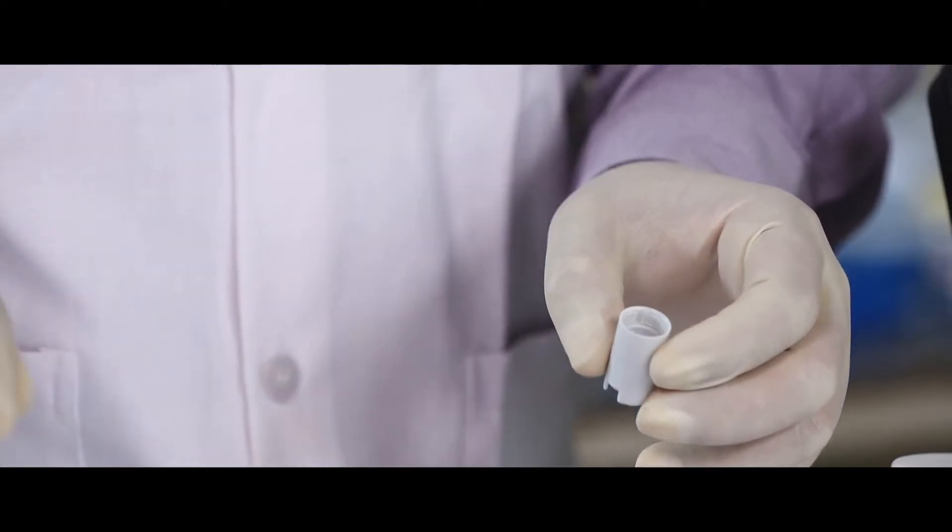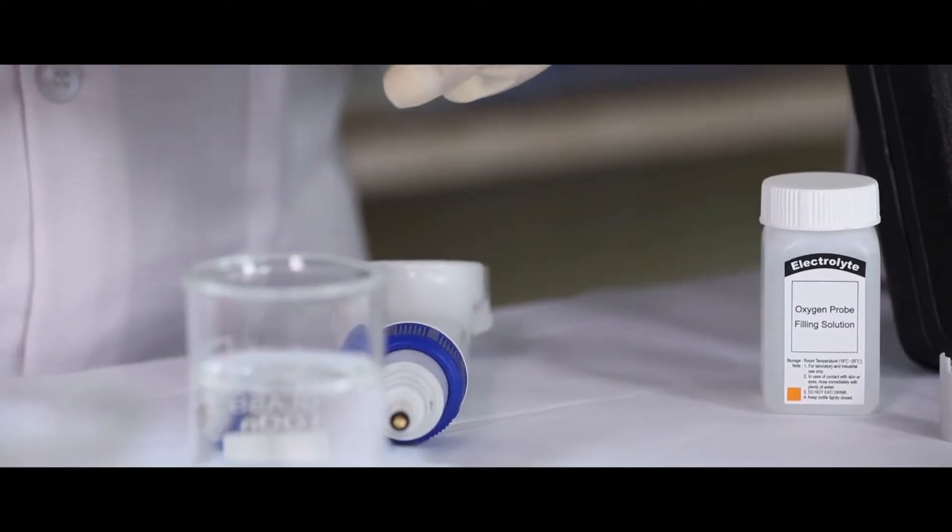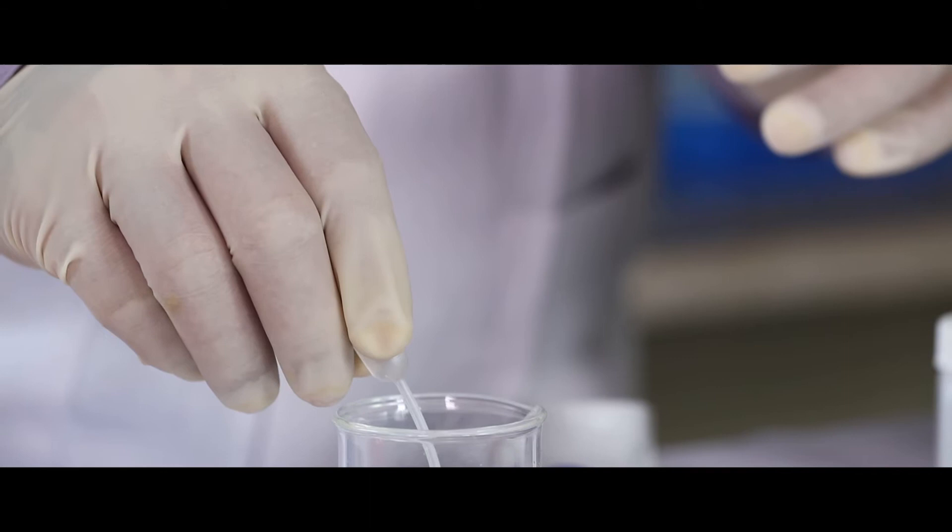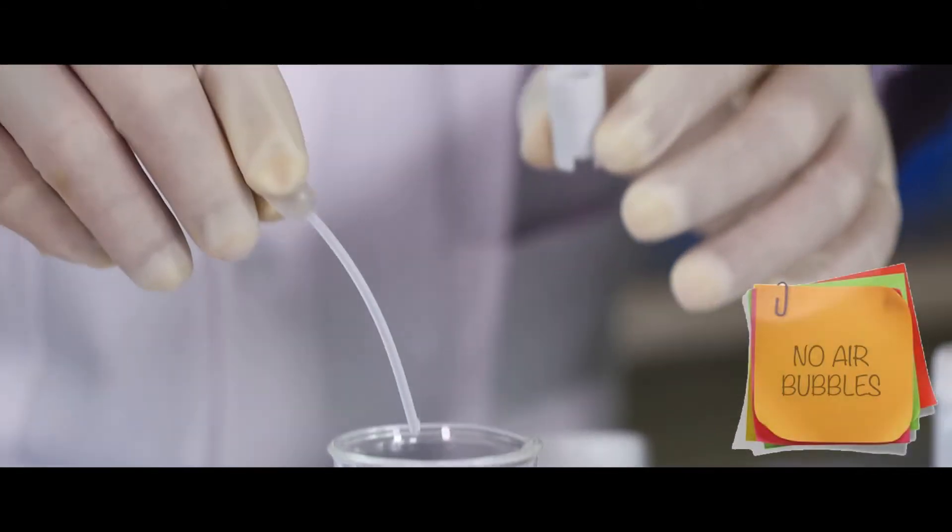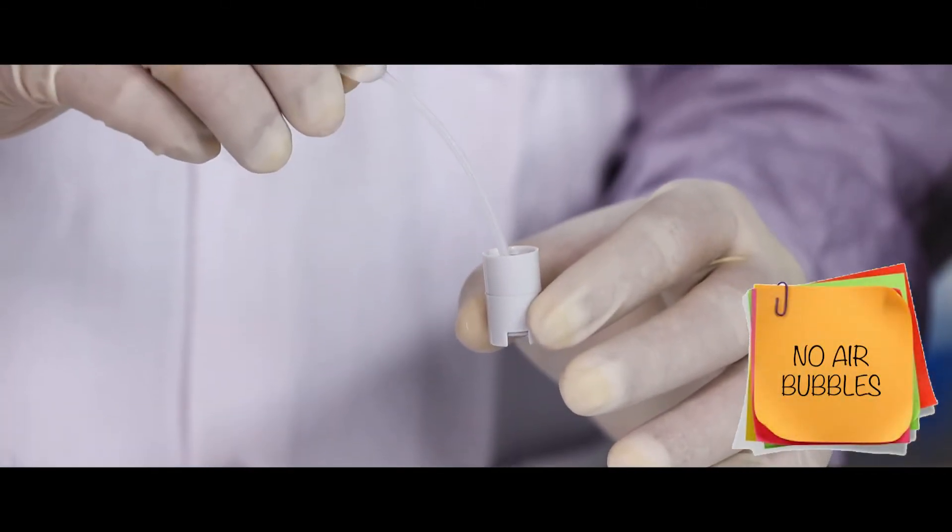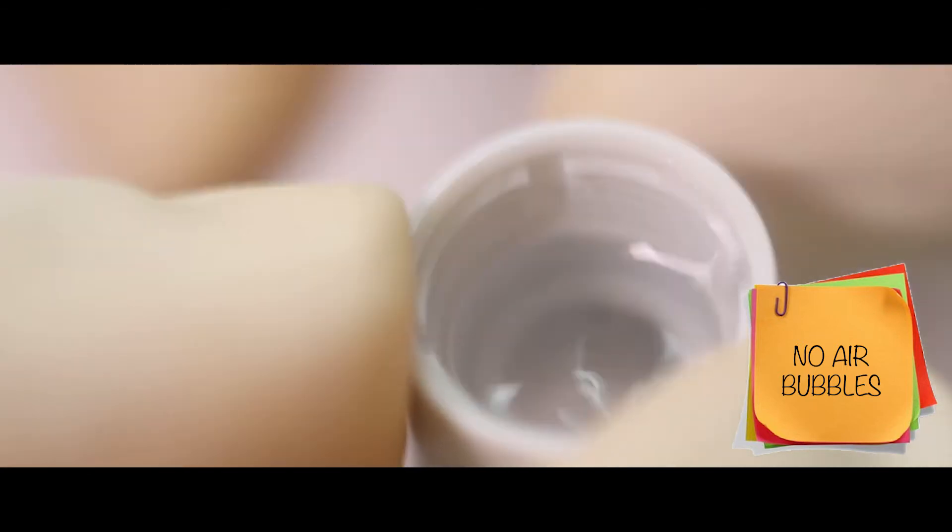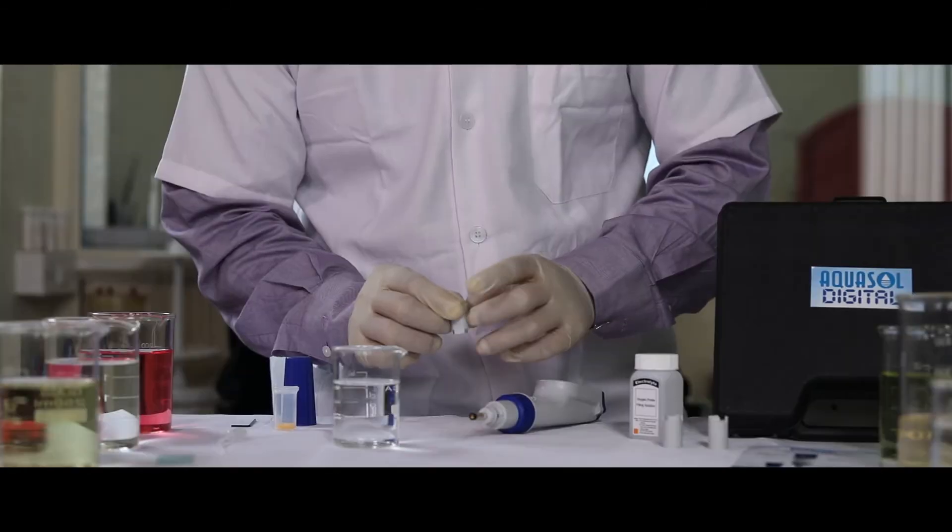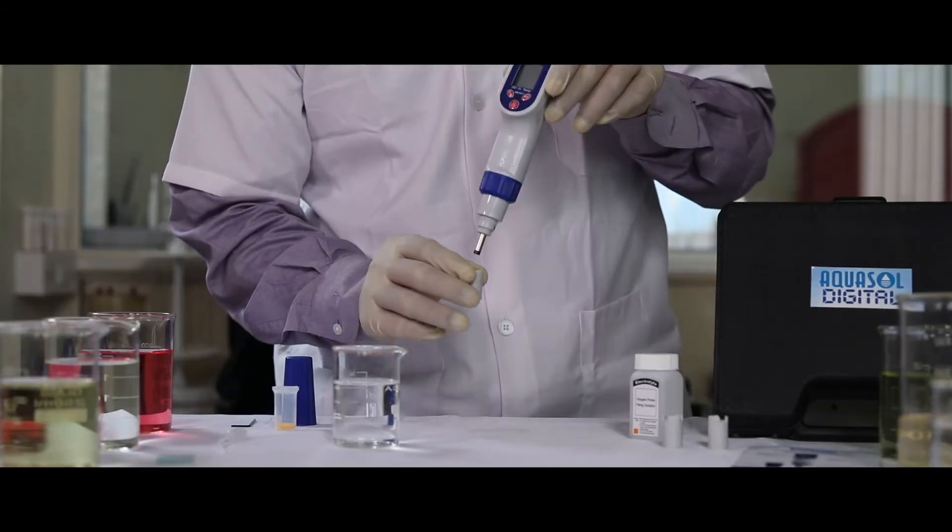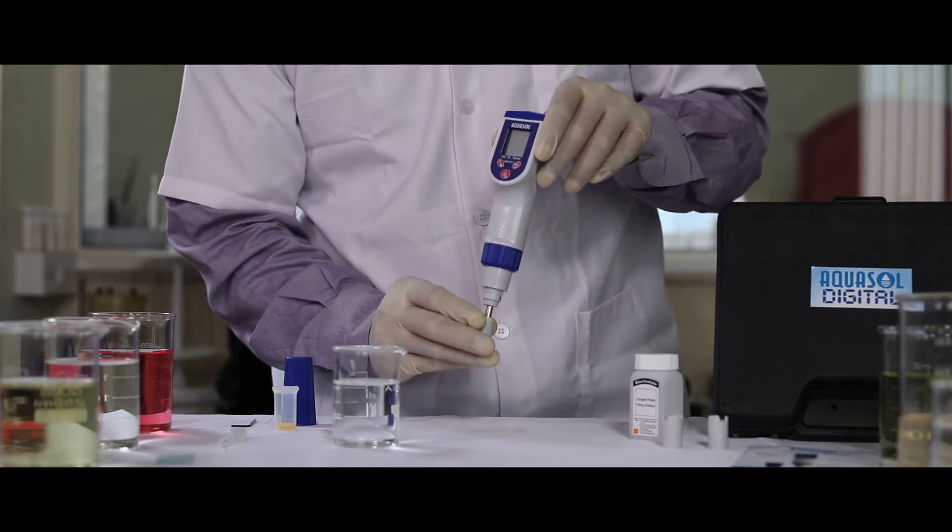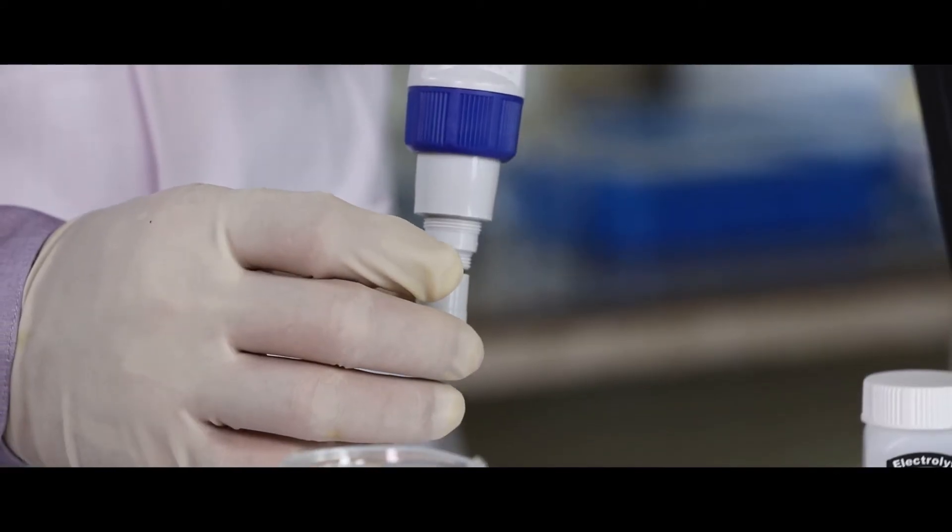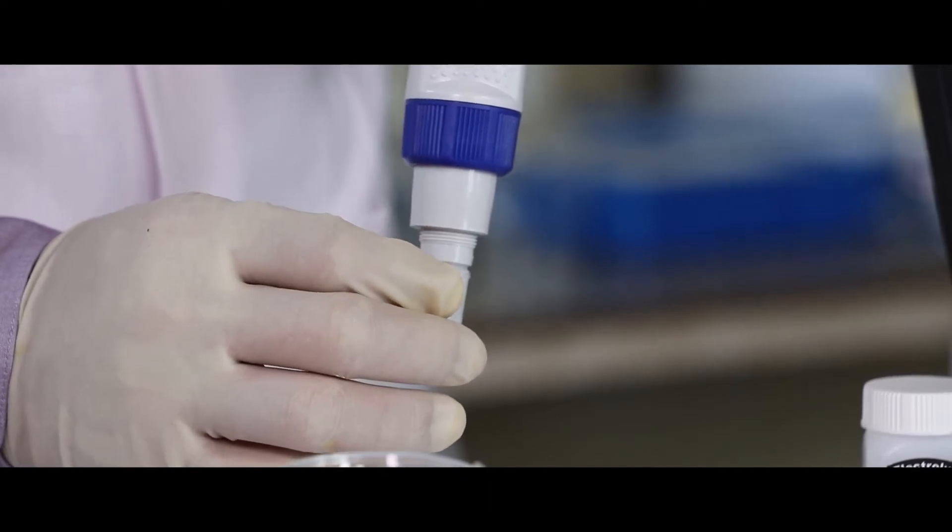Fill the membrane cap with electrolyte solution. Make sure no air bubbles form and fill it to the rim. Carefully insert the probe into the membrane with a little bit of overflow and screw it back slowly until tight.